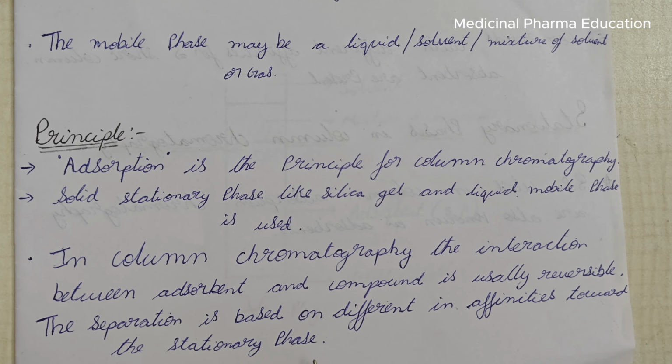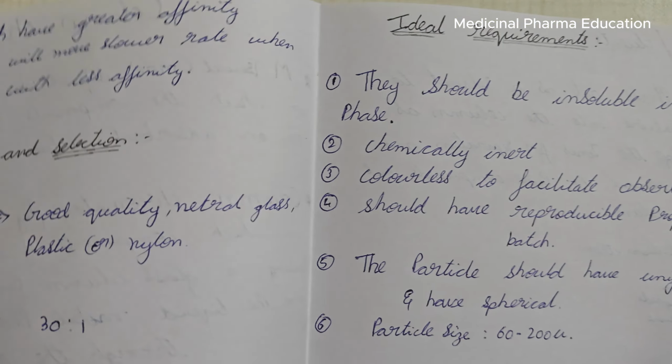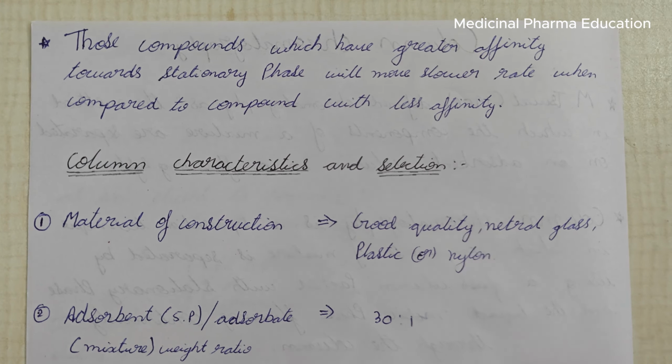Almost every chromatography technique is based upon the affinity towards the stationary phase. This is the principle. I hope you are understanding the concept. If you're not understanding, or my explanation is not up to the mark, you can comment so that I can improve in the upcoming videos.